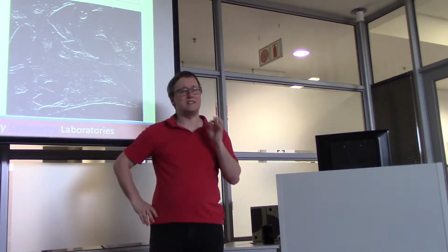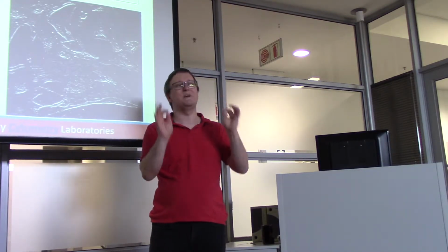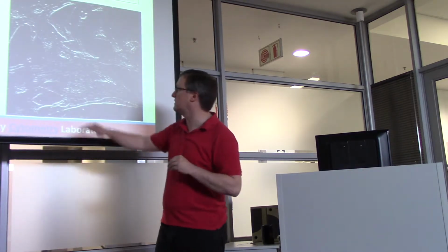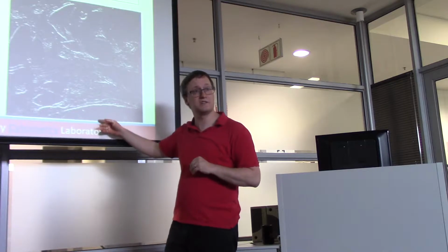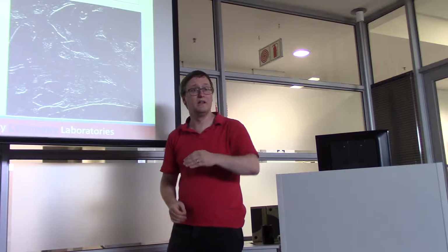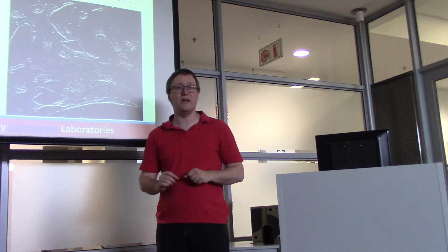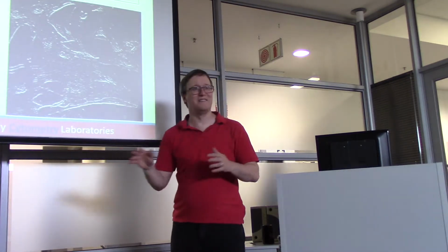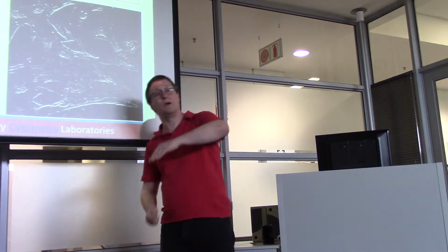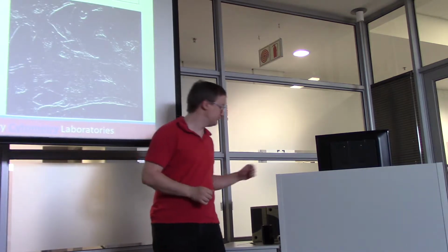Remember, the point is not to make something that's photographically pure in some way. The point is to maximize our information from these images. So if your goal is to find boundaries of things, using a Sobel filter is a really good option because it's going to highlight those very strongly. It's quite different than the purpose of a Gaussian filter, which is designed to make the noise go away. Here we're not talking about the original content of the image much at all, except that where we've got these horizontal crossings, we want to make them light up very brightly.